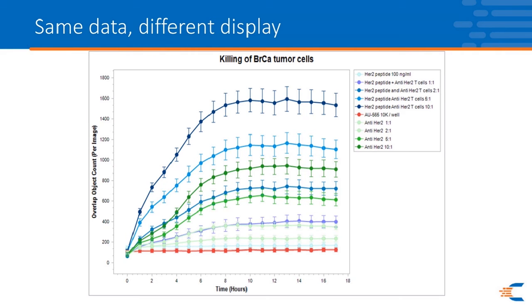The data still makes sense if you compare it to the prior, but the question becomes, is it appropriate to normalize to the starting point? What I think we've settled on is to normalize it to the number of cells per well. And again, this is the advantage of using 2 labels rather than just one. We could have run this experiment just with the caspase label, and we probably would have ended up with data that looks kind of like this. But I haven't gone back to reanalyze this with our more recent adoption, and I'll show an example in the next slide.